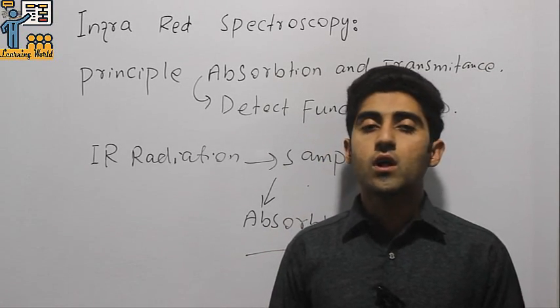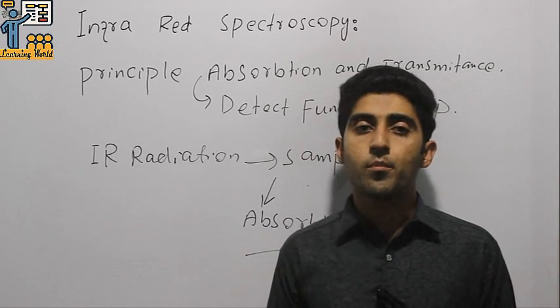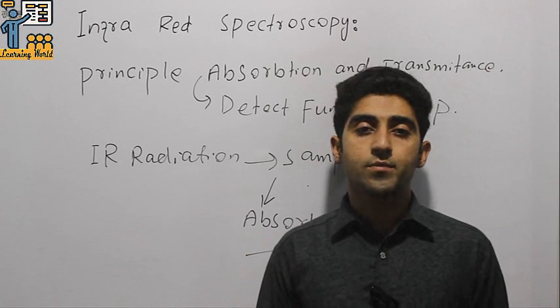In the next section, we will talk about the instrumentation of IR spectroscopy and some other important points of IR spectroscopy.